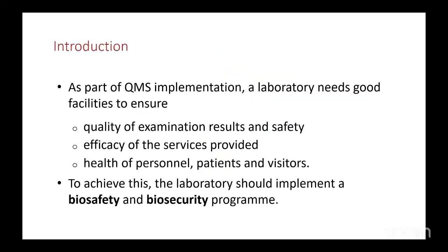Now, by way of introduction, as part of the QMS implementation, a laboratory needs to ensure that the quality of examination and results are safe. There must be safety. As part of a good facility, it helps in the efficacy of the service that is provided. The health of the personnel, the patient and the visitor are also important. To achieve this, the laboratory should implement what is called a biosafety and biosecurity program. You're going to know the difference between biosafety and biosecurity.